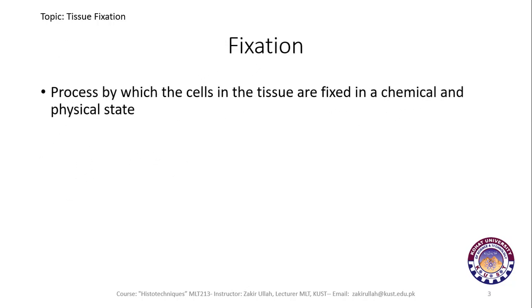Coming to the first part of the lecture, that is fixation. Fixation is basically a process in which the cells or the tissue are fixed in a chemical as well as a physical state. As we know, when a tissue is removed from the body, the oxygen supply and the food supply are discontinued and disconnected.